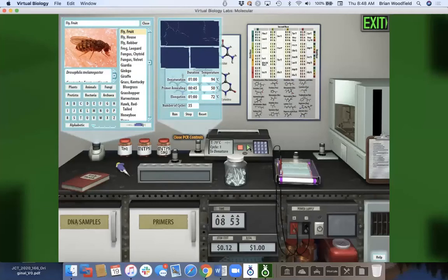So Brian, could you show one of our forensics type worksheets, right, because this is kind of overwhelming to a high school student, how much is here.